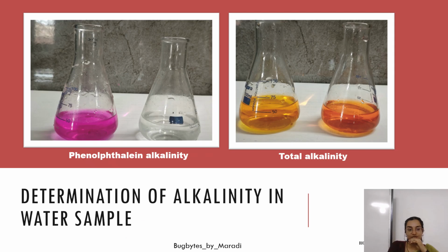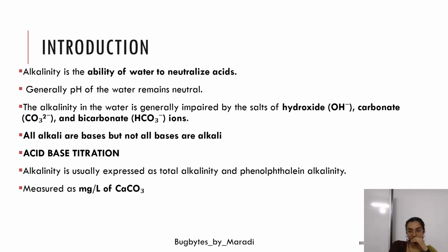So, today we'll be speaking about the topic that is determination of alkalinity of the water. In this particular video, we will be discussing what alkalinity is, along with how to perform this experiment, and what the applications are, why we are actually conducting this experiment in the laboratory.